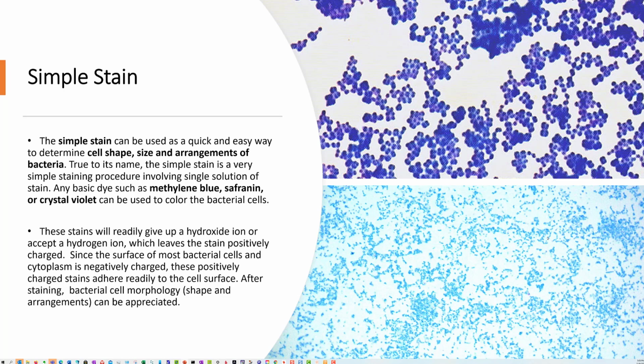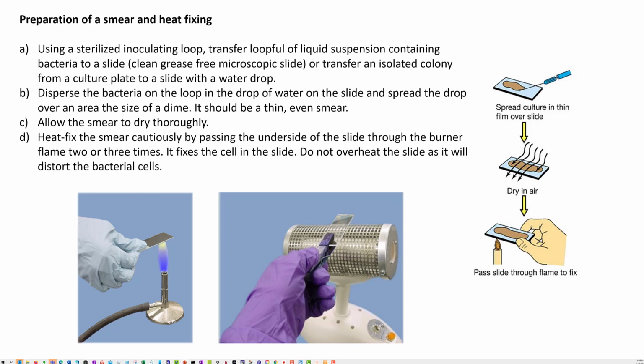So obviously, the gram stain on this side over here looks more like a staph of some kind, and it would bias me from the standpoint of tests that I would run. That's really the purpose of using either a simple stain or a gram stain: to give you more evidence in what direction to go, because we don't want to spend time spinning wheels, and also to try to keep the cost down. We don't want to run all the types of media that we have at our disposal.